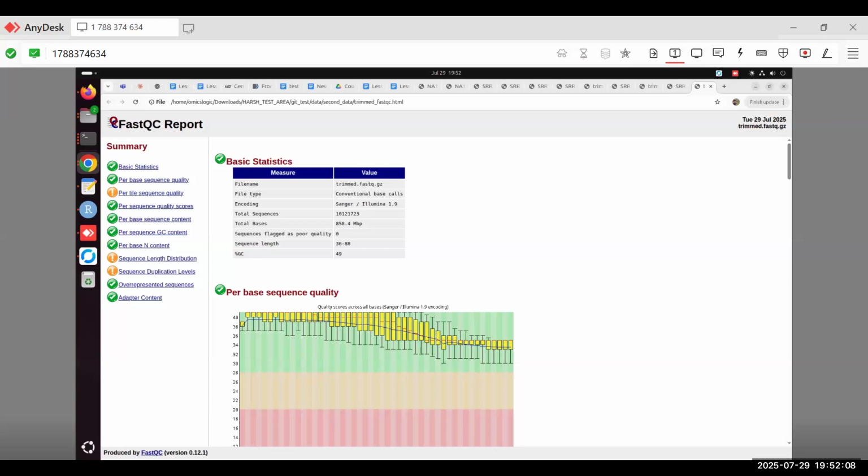Here we have discussed the basic central dogma and quantification introduction. And then this is the entire workflow that we have. Then you can learn about the QC. Then we have principal component analysis for the count matrix that you can use. This is the statistical test I was talking about. Once you have the count matrix, you can have different test codes here, why it is important, and we have also the R codes available here.